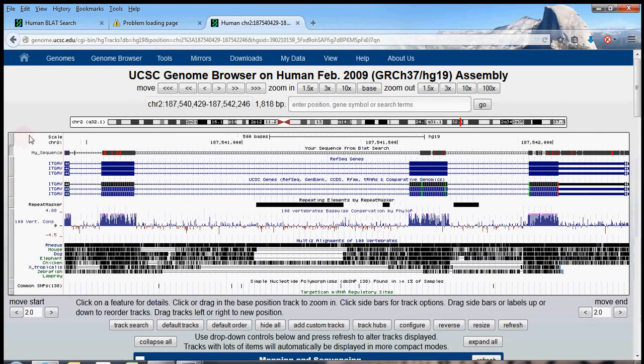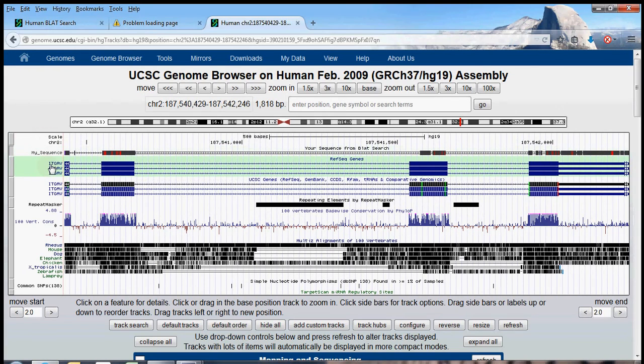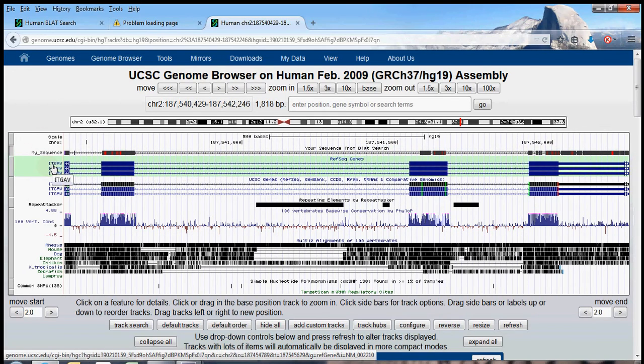I see. So BLAT thinks that the sequence I submitted came from a gene ITGAV. That is an integrin, it codes for an integrin protein, which is a membrane protein.